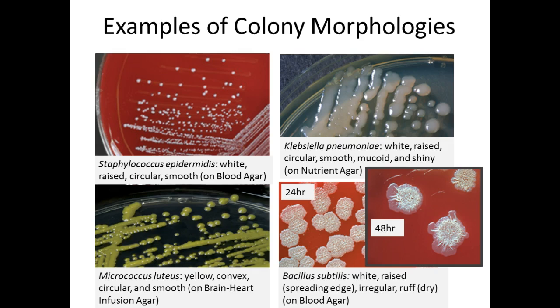Each time I give you an organism, look at it, right? Is it white? Is it creamy? What does it look like, right? And write it down.